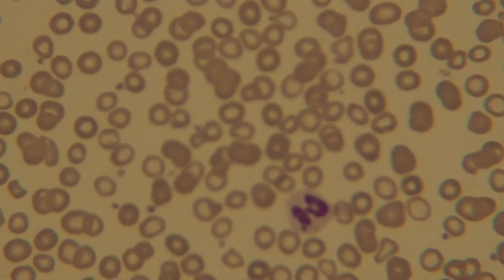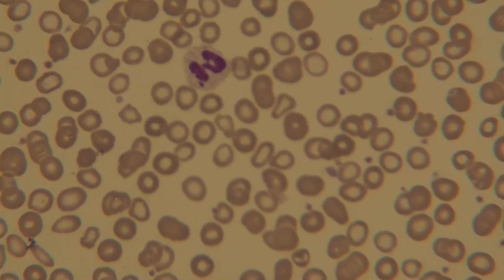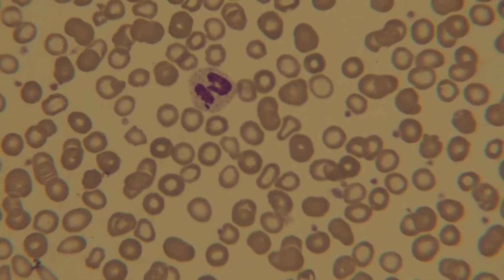With the camera, sometimes it's difficult to find the focus when I go from one to another. Okay, let's start with the neutrophil.